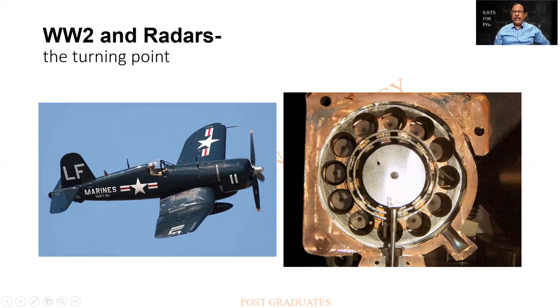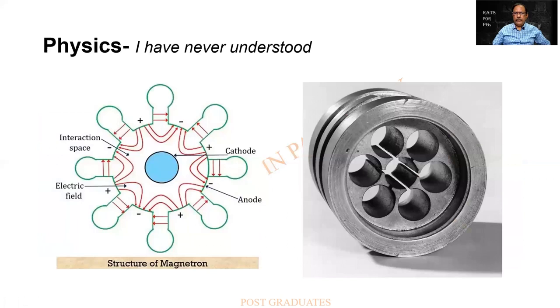Normally whenever an energy is being created, it gets lost also. This is called half-life. But in order that the energy be preserved and prolonged, they built a case around it. That is what you are seeing in the brown. So this is a case that preserves the energy. If you are not sure about it, see the next picture.